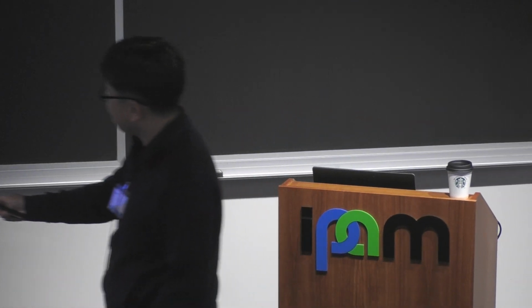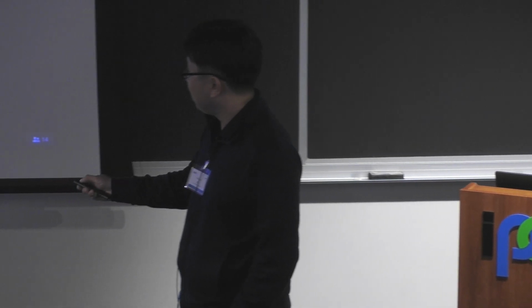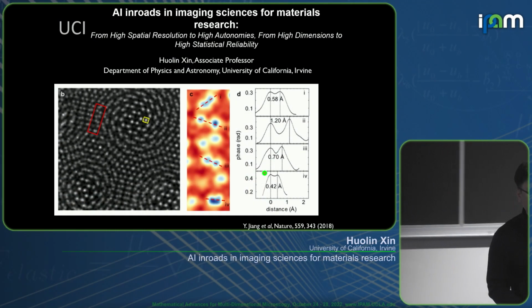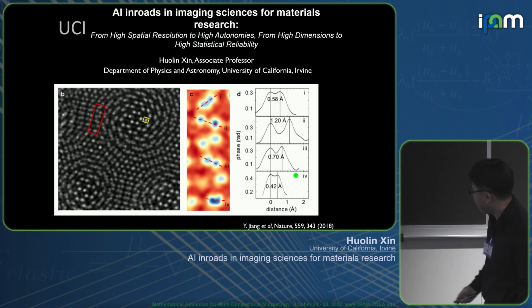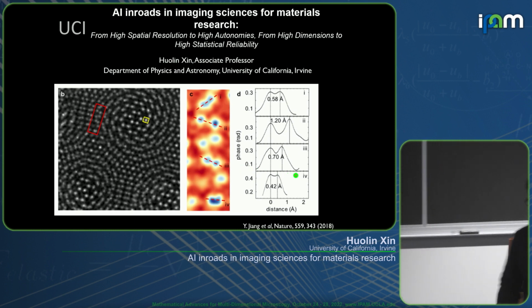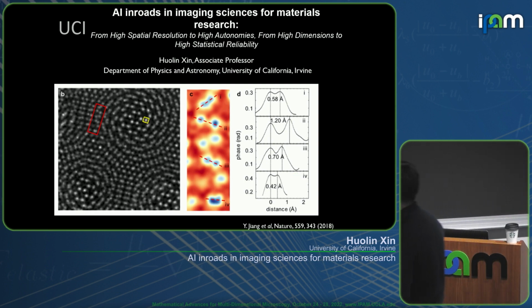But we know as electron microscopists, or in the optical community, you need to have about 20% contrast to claim you've resolved a spacing. It's a little bit shy of it, isn't it? Well, this is not to dispute the resolution. They go down to 0.25 now, right?